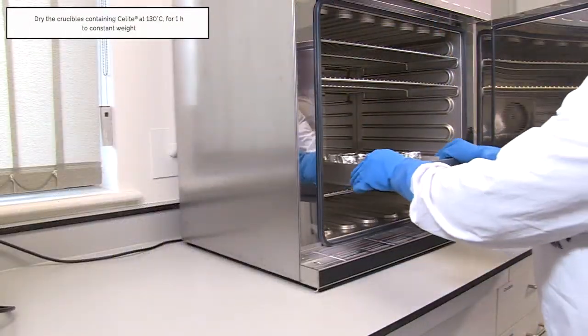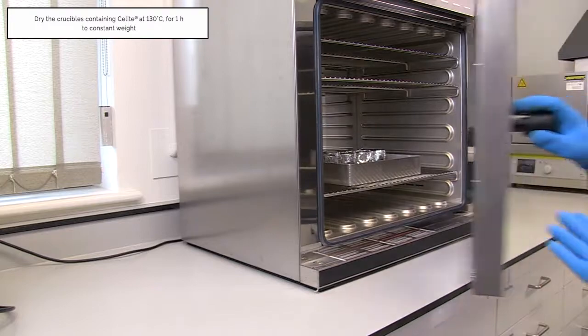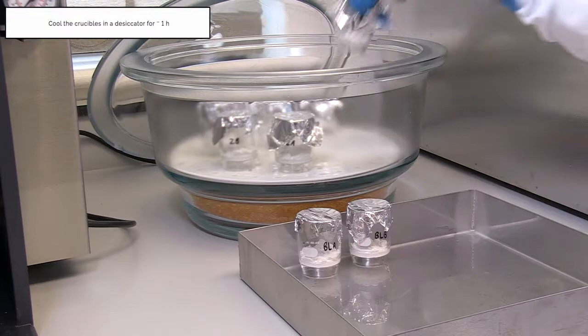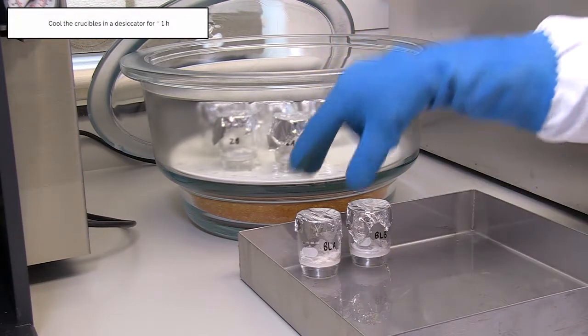Dry the crucible containing celite at 130 degrees Celsius for one hour to constant weight. Cool crucibles in a desiccator for approximately one hour.